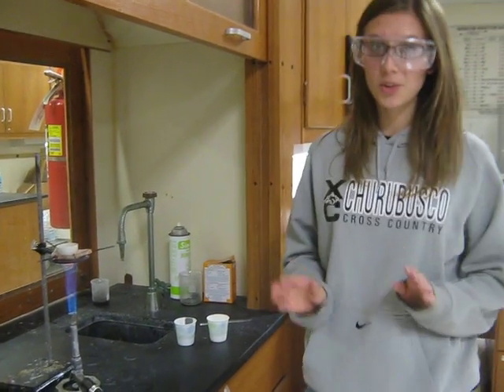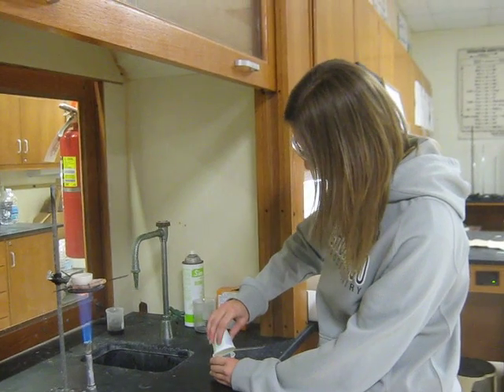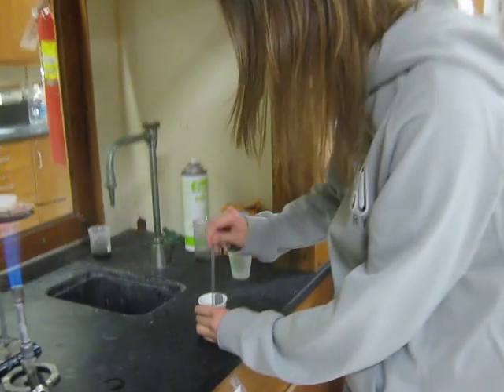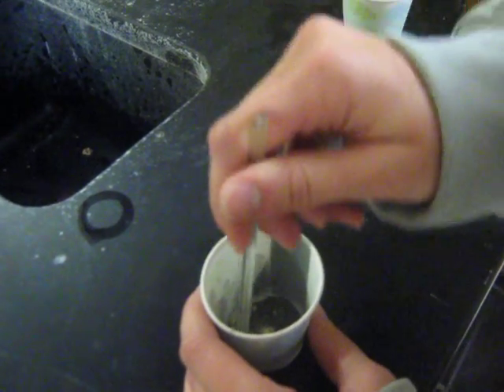After you have massed your powders, you mix them together into a homogeneous mixture. Make sure there's no clumps!